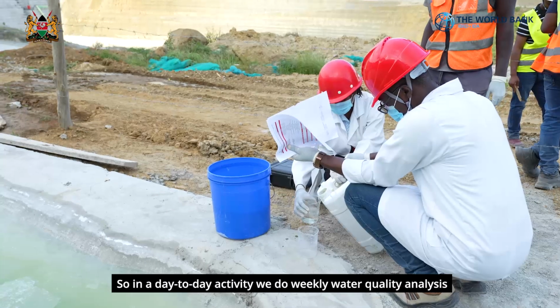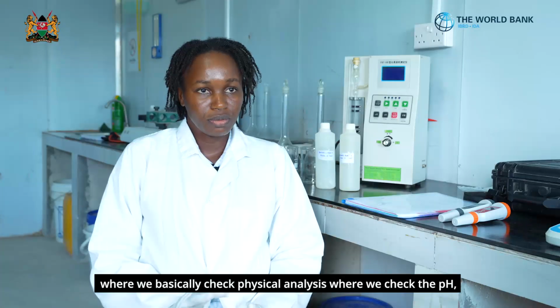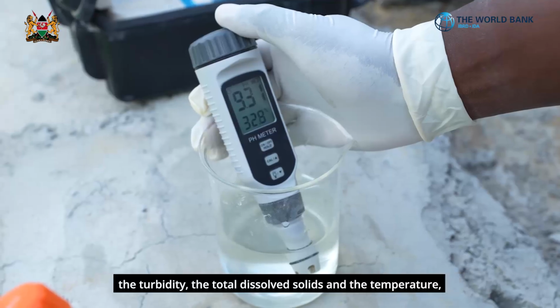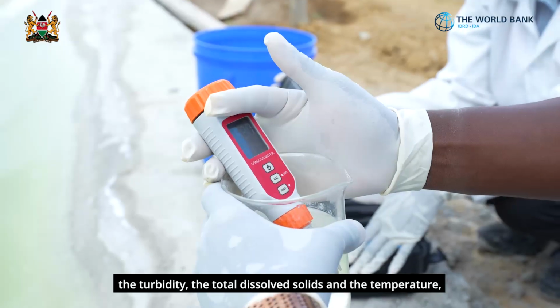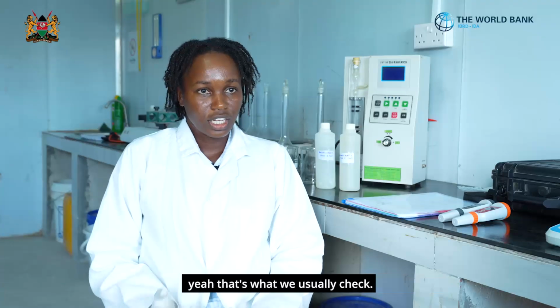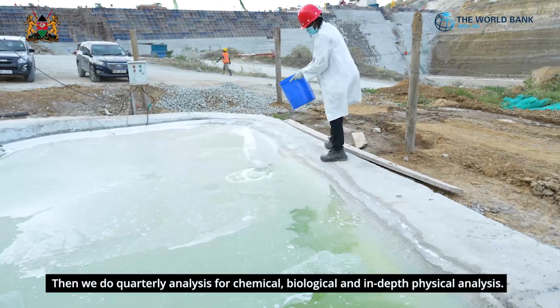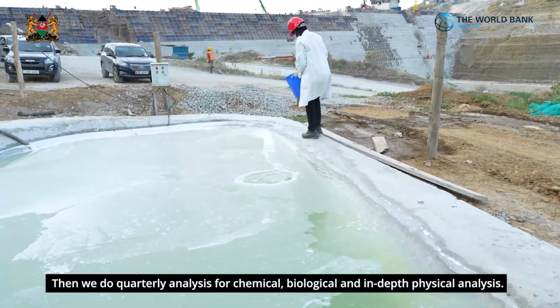So in a day-to-day activity, we do weekly water quality analysis where we basically check the physical analysis, where we check the pH, the turbidity, the total dissolved solids, and the temperature. Yeah, that's what we usually check. Then we do quarterly analysis for chemical, biological, and in-depth physical analysis.